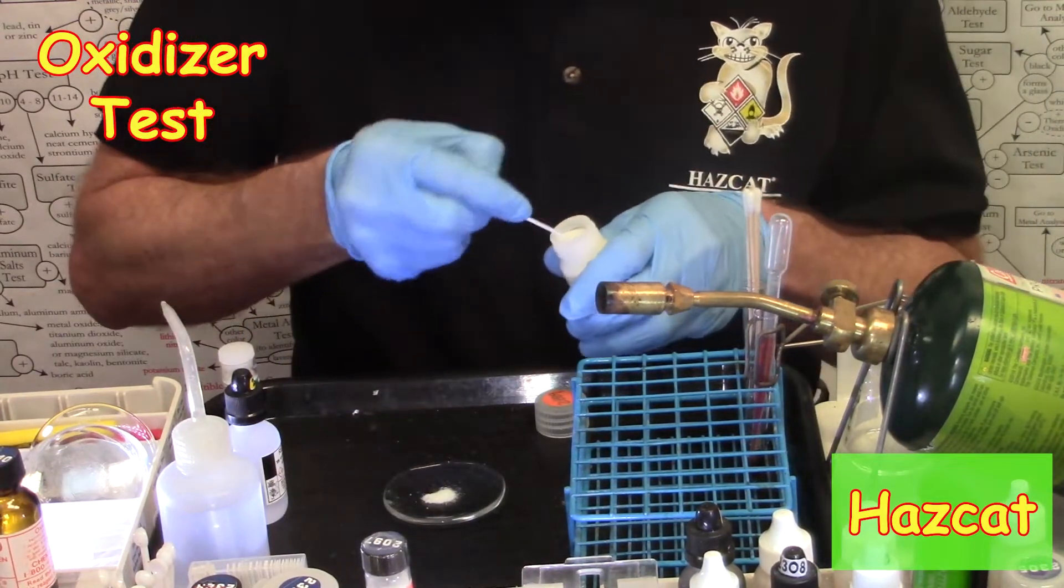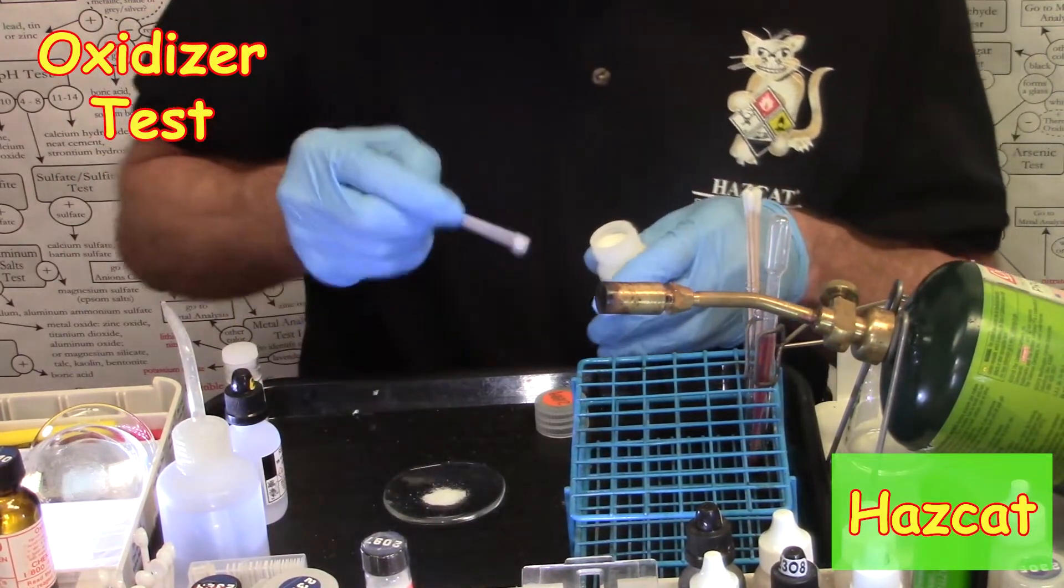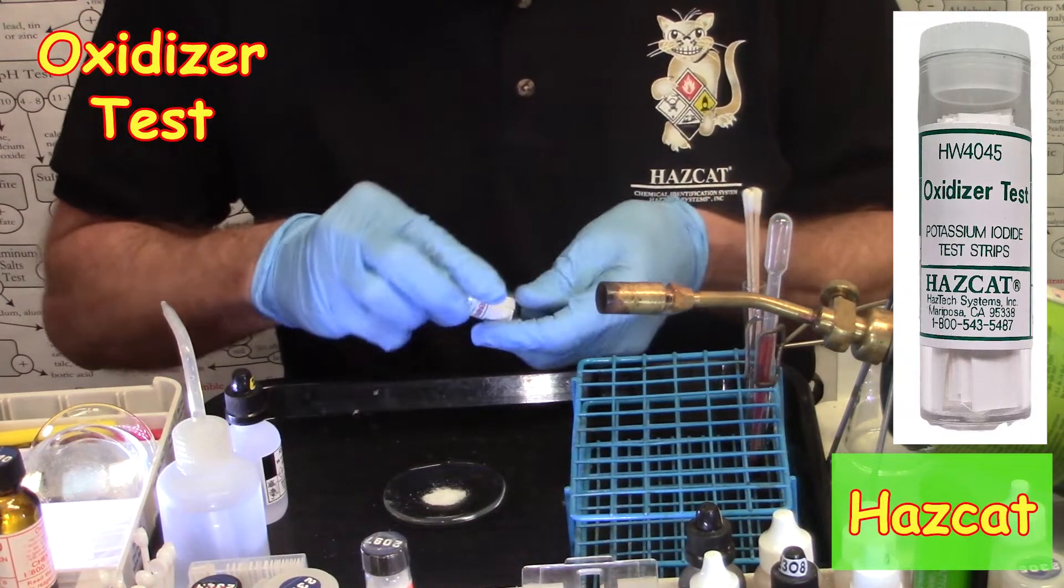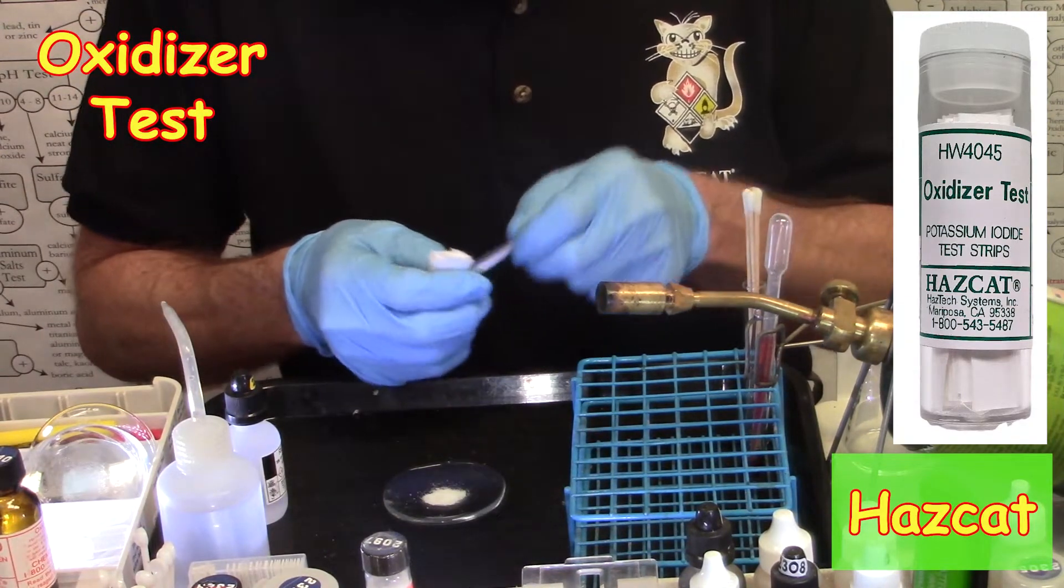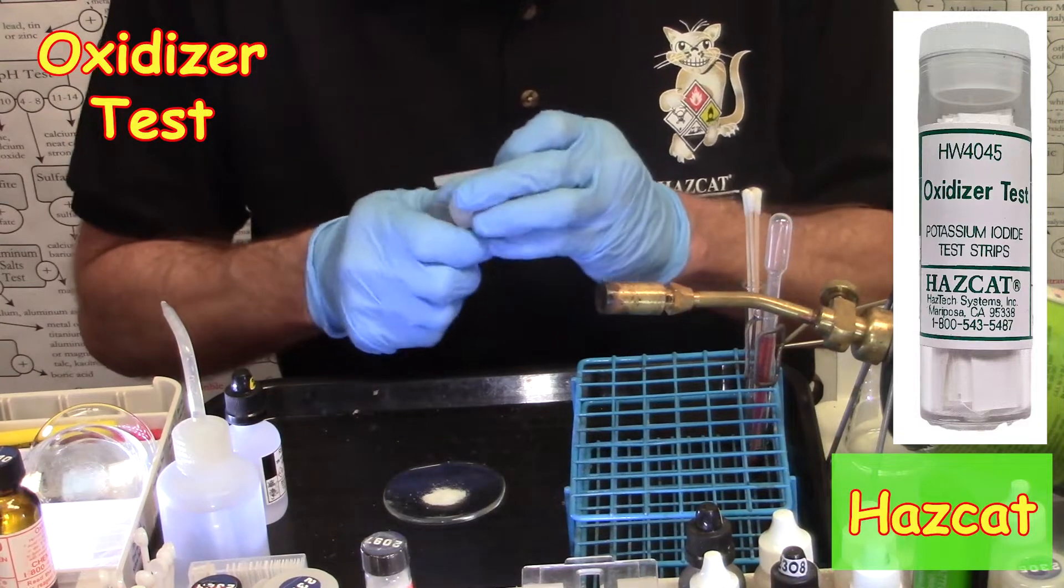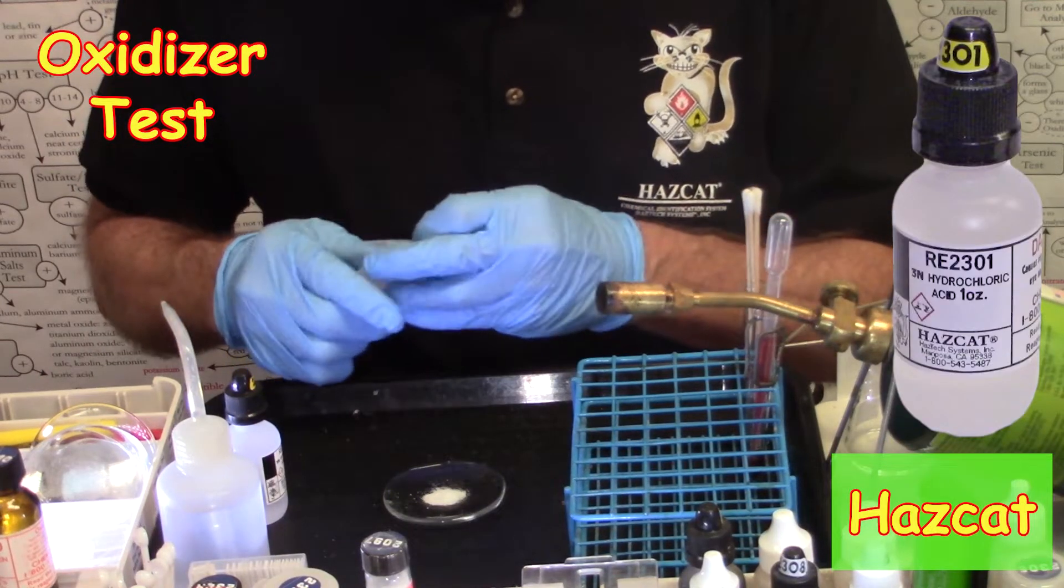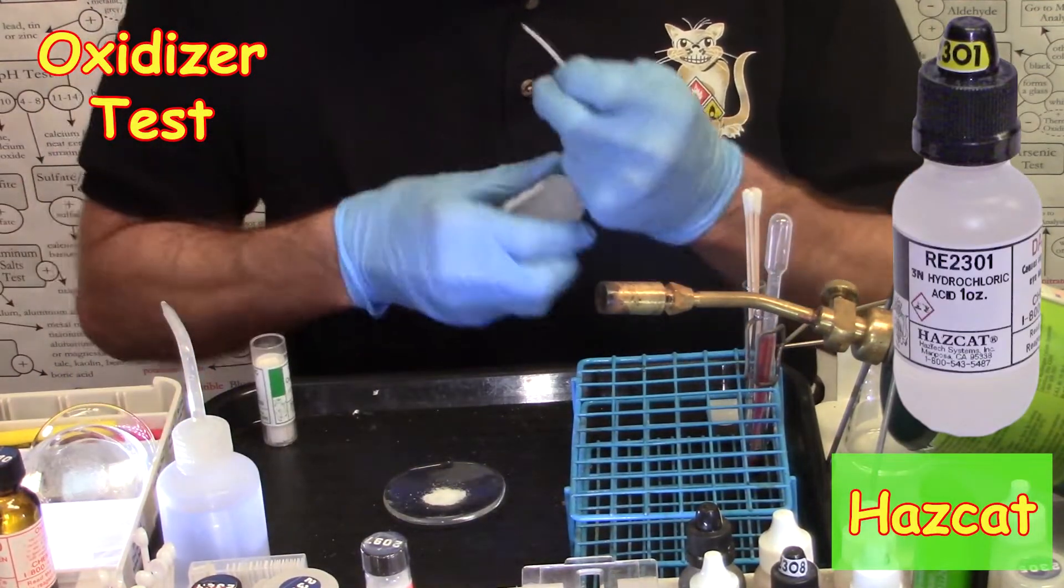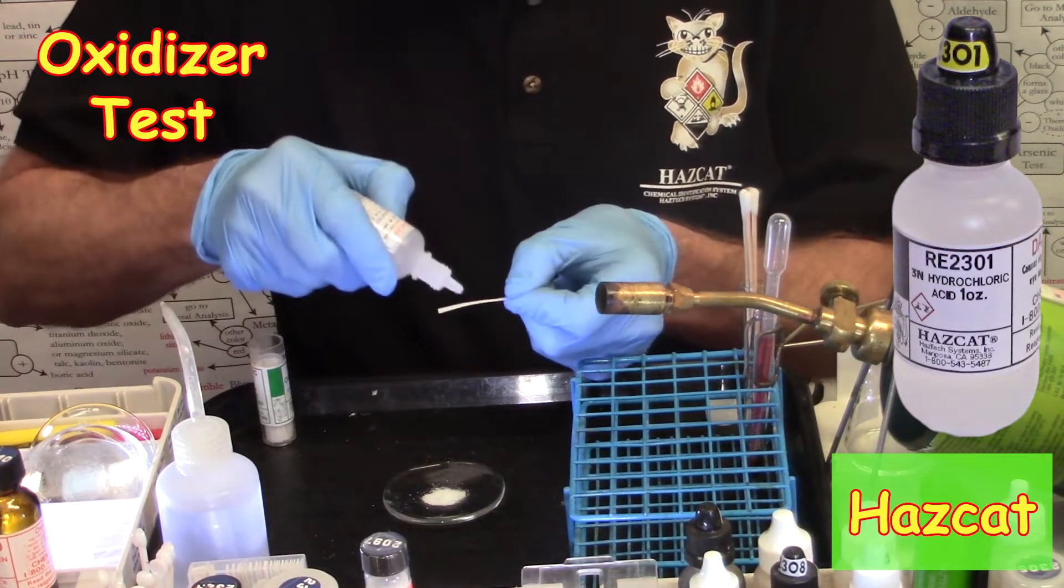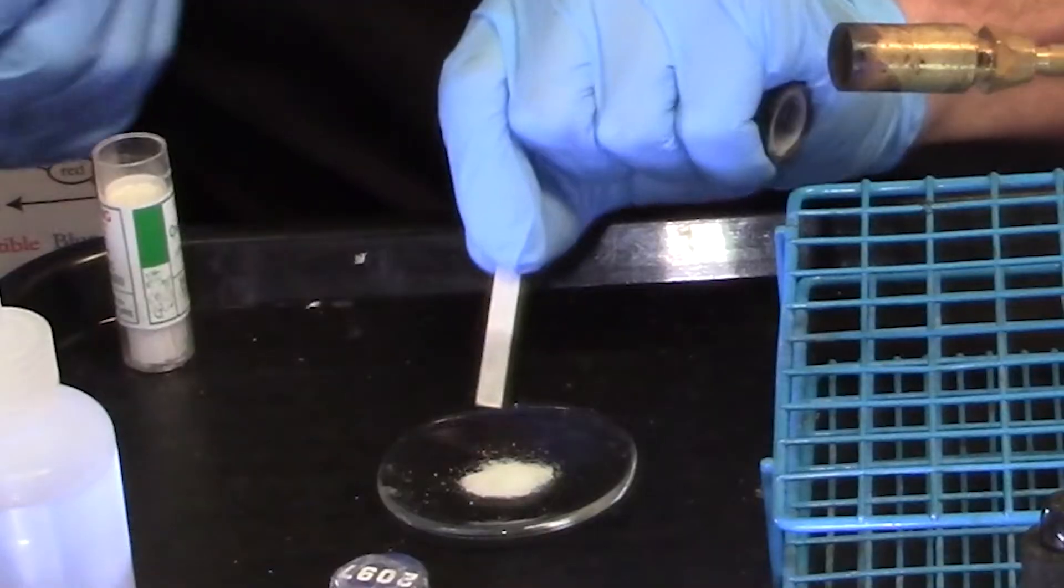One, two. Take a strip of oxidizer test paper. Wet it with two drops of 2301. One, two, and then rub a dub dub.